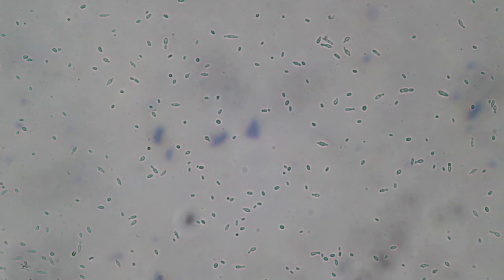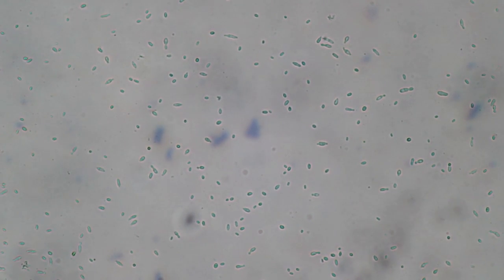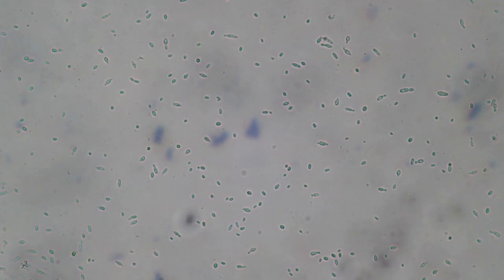Here at a lower magnification, the 4x objective — if you move in and out of focus, you can see them actually quite clearly because they turn into dark spots.